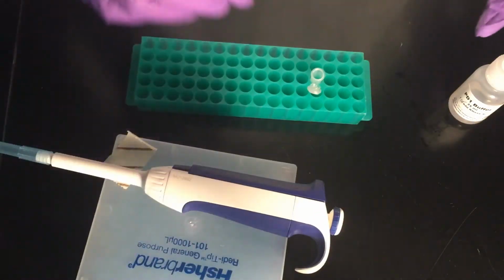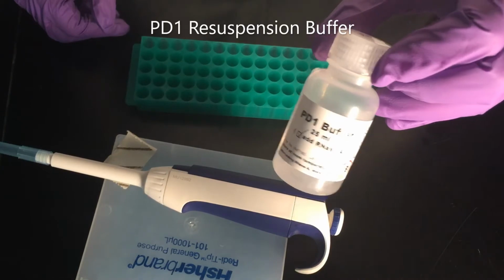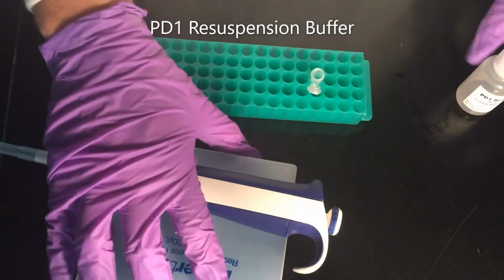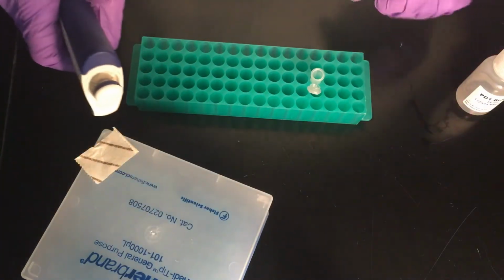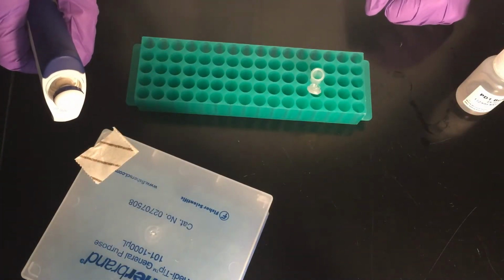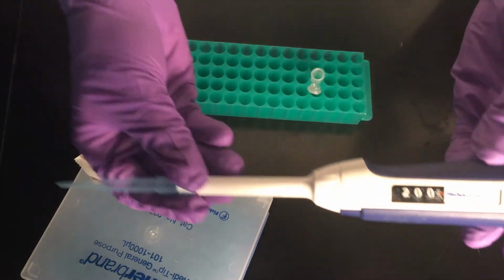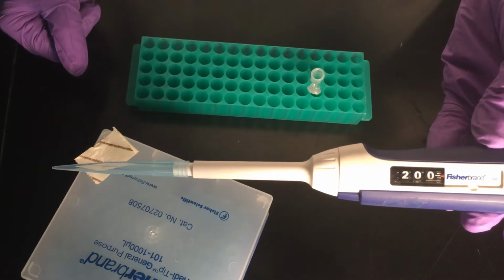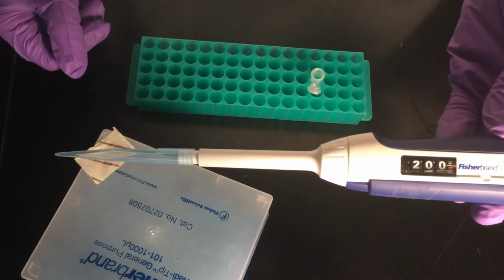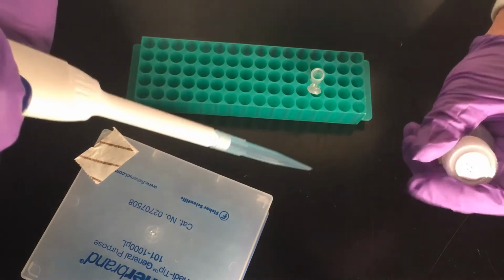So at this stage, what I'm going to do is resuspend my cells in this PD1 buffer. The PD1 buffer is an isotonic solution, and it also contains RNase, so it's going to digest away any RNA that's found in the solution. I'm going to use this micropipetter. This micropipetter is a device for measuring small amounts of liquids, and I'm going to measure 200 microliters inside the micropipetter tip. So here goes.